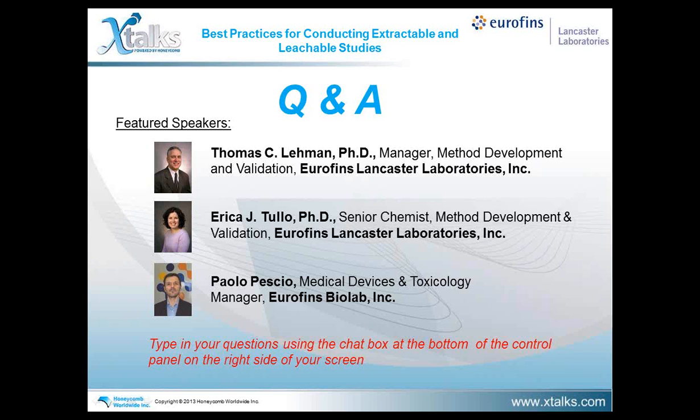Another question here. What type of instrumentation do you use when establishing methods to monitor leachables? It's very dependent on your product and also the assessment from the tox evaluation as to what type of sensitivity you need. Since these methods could be used more in a routine setting as part of stability, you have to take into consideration the usability of the method and also the availability of instrumentation in the lab. A typical approach we take is that if the matrix is not interfering with the analyte of interest and the level is such that we can get it with common detection techniques such as UV or with LC analysis or GC-FID, we would take those approaches. But in many cases, the matrix may prohibit us from doing that because those detectors are not specific enough to hone in on leachables when we're dealing with matrix interference.